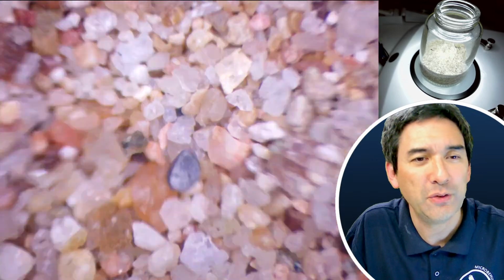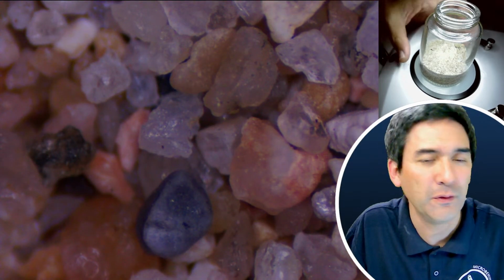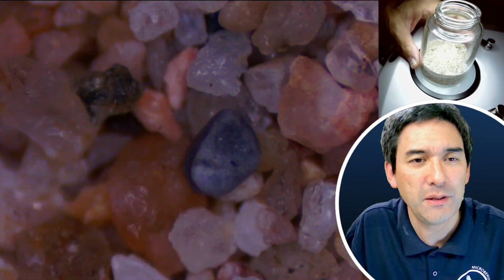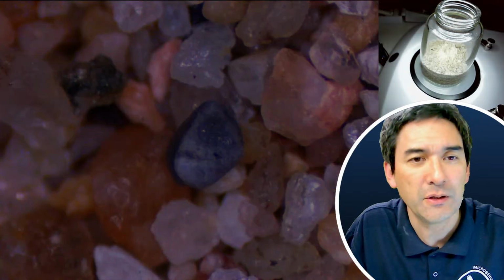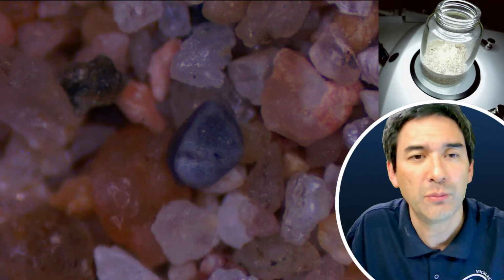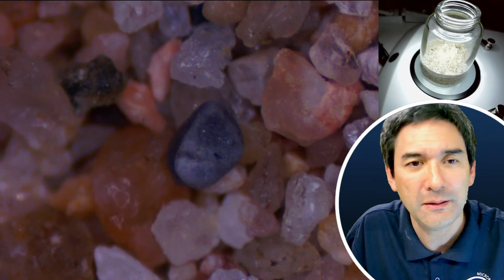You might have noticed that over the last couple of weeks or so, I've repeatedly used the stereo microscope. I'm doing this deliberately because I do want to also promote stereo microscopy a little bit, because I think it's also pretty cool.